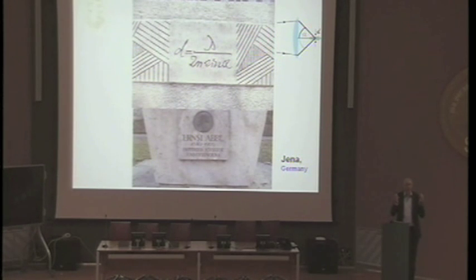It means that if we have two features of the same kind that come closer together than this distance d, given by the wavelength divided by this number, which is usually something like 3, it's not really possible to tell these features apart. And this number typically amounts to about 200, 250, 300 nanometers. So any detail that is smaller than that, if molecules, vesicles, whatever that is, come closer together than this distance d, the representation in the image will be blurred. It will not be recognizable as a structure.